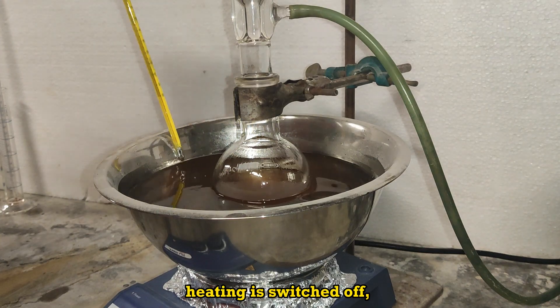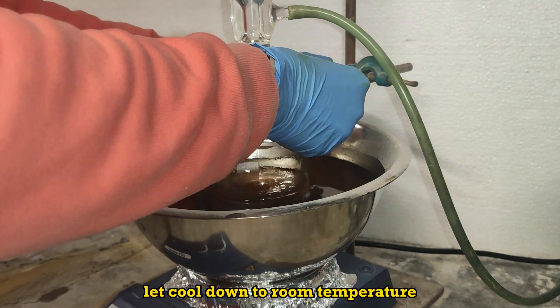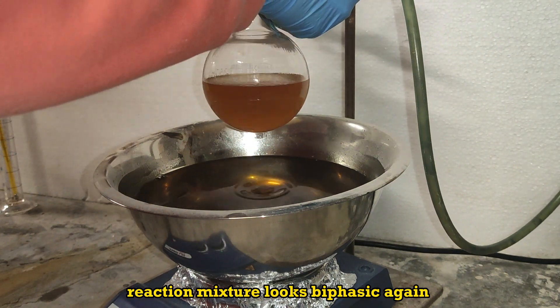After a total of 8 hours, heating is switched off. Flask is removed from the bath and let cool down to room temperature. The reaction mixture looks biphasic again.